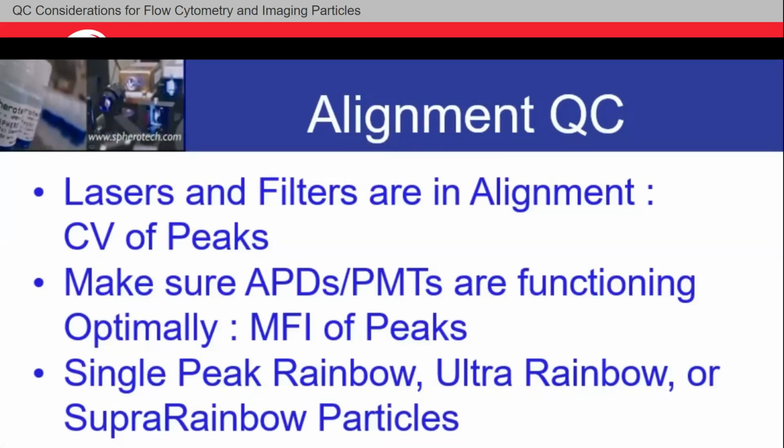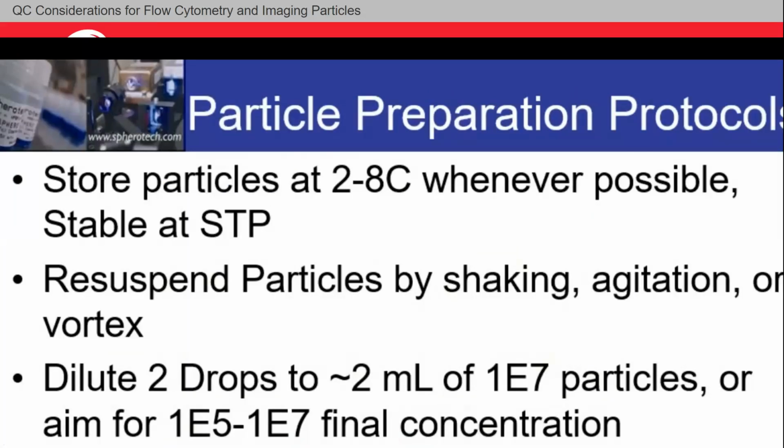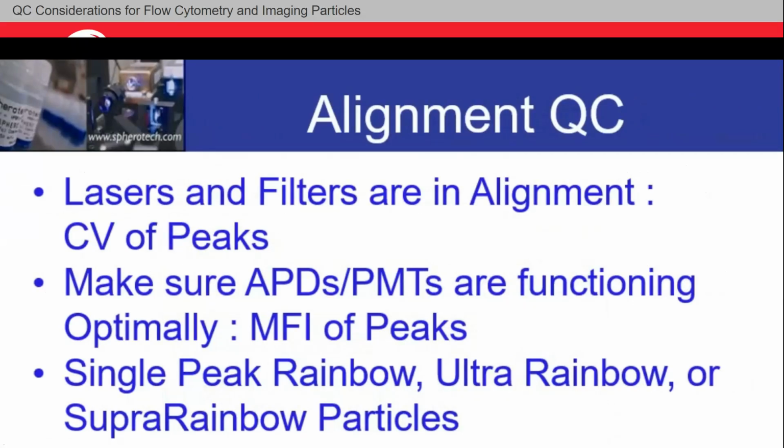This is what you need to agitate, right? We mentioned agitating, resuspending particles by shaking or agitation. This doublet would be a key sign to me that it's possible this is an artifact. If I'm not getting over 85+% singlets inside of that P1, chances are good I should put my instrument on pause, agitate my particles, rerun them, and see if I can get that higher singlet percent.